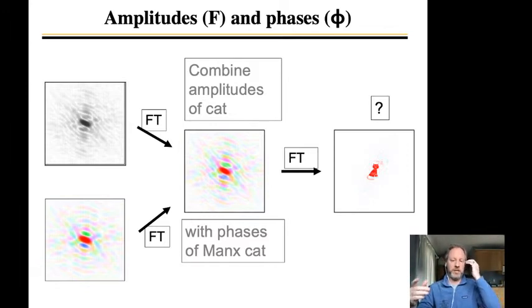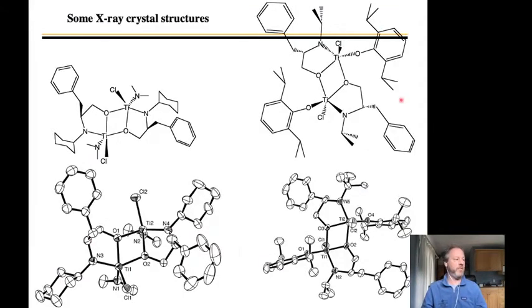And if you have some sense of what's in there, so for me, on the next slide, I'm looking at titanium that's attached to nitrogen, oxygen, or chlorine. If I can then see the titanium and then see the chlorine and the nitrogen, the rest of the structure will often build out. Now, to be honest, modern diffractometers, like the one we have in the lab, are so good and the data is so rapidly acquired that often, the first time the computer solves a structure, you get basically the perfect structure, for a good data set anyway.